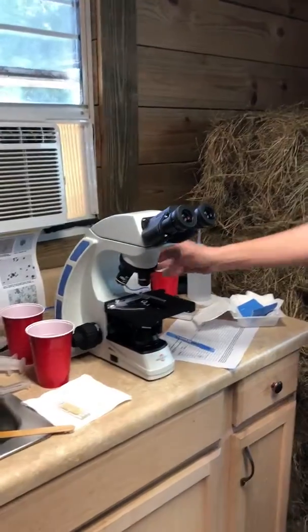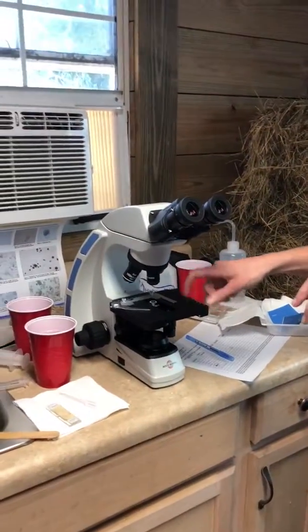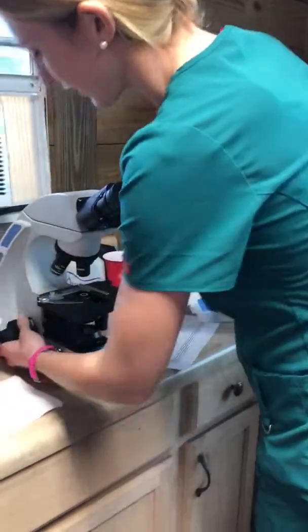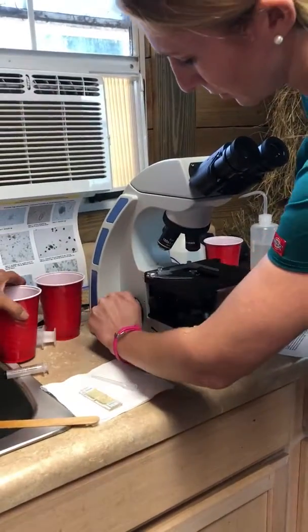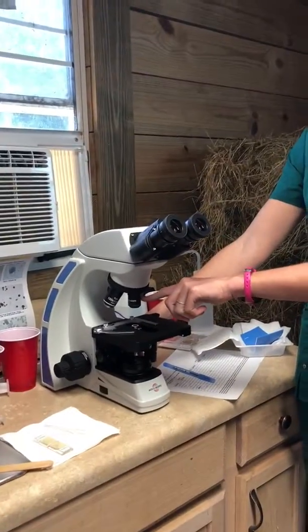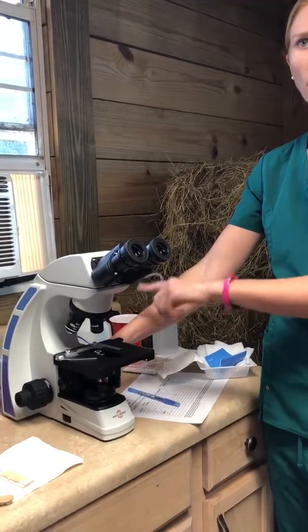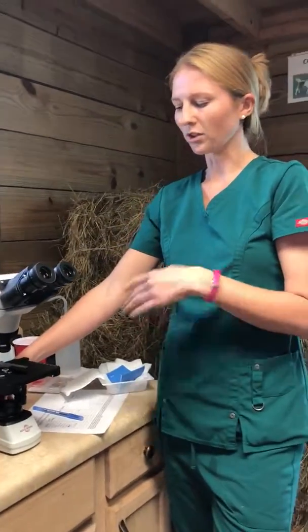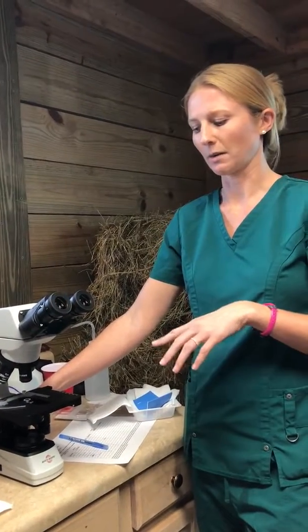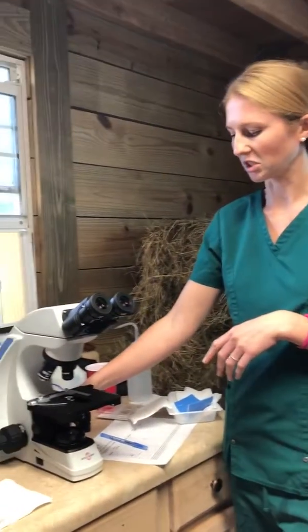So this is the stage — that's where the slide sits, and it can be moved up and down on both sides. These are called objectives, so you have a 4x all the way up to 100x. All you're going to worry about using is the 4x, possibly the 10x — it depends on your eyes and preference. I usually look at fecal egg counts on a 10x more often than not, though 4x is just as fine.